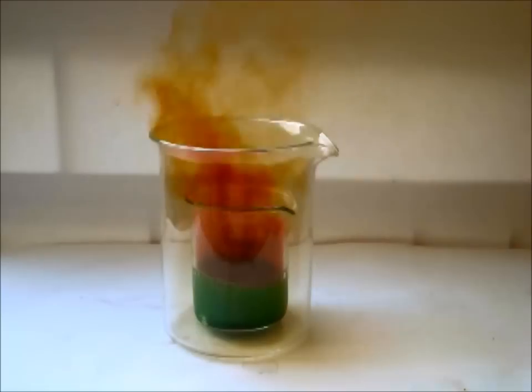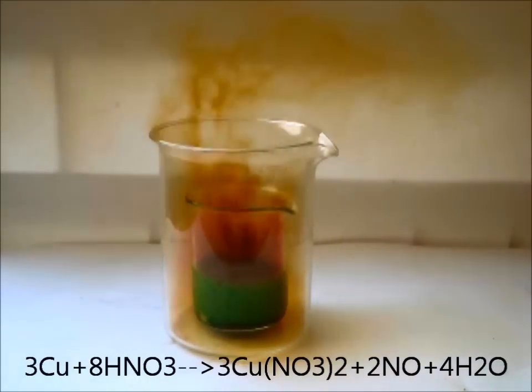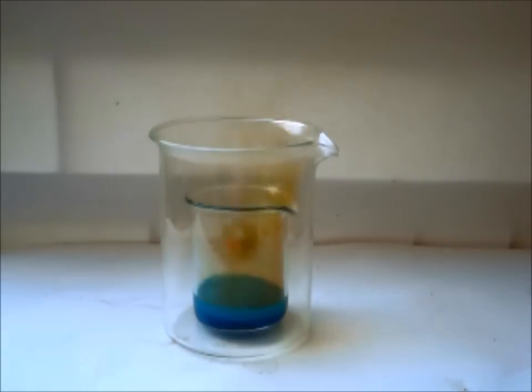Here I show you the reaction. It lasts a long time, so let me skip over this part. Now it's almost over, but it's better to let it rest overnight. As you can see, the solution has turned azure, given by the Cu2+ ion.